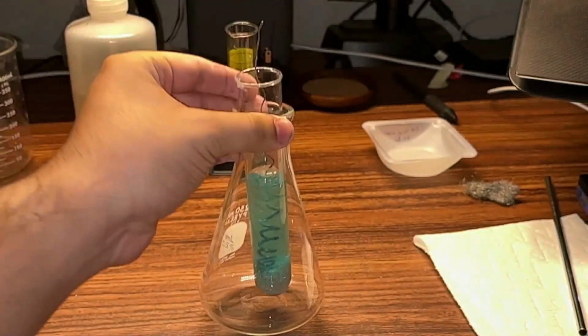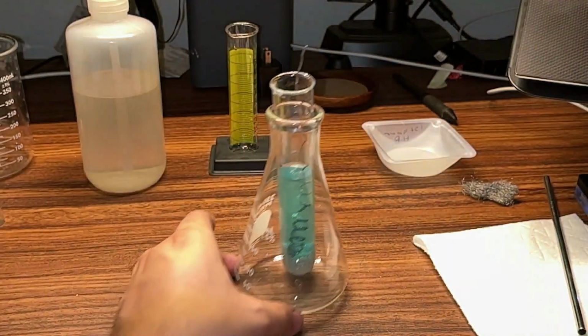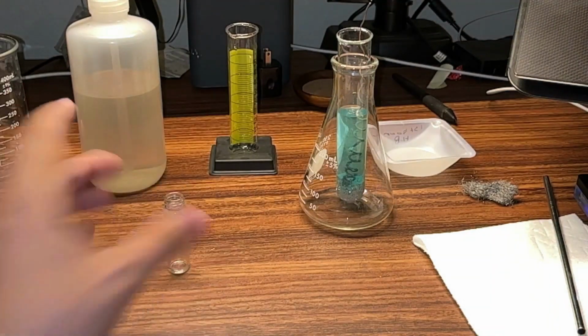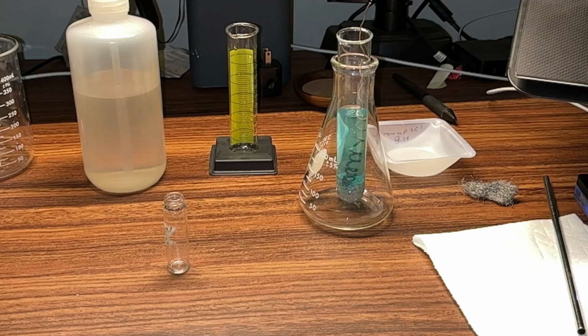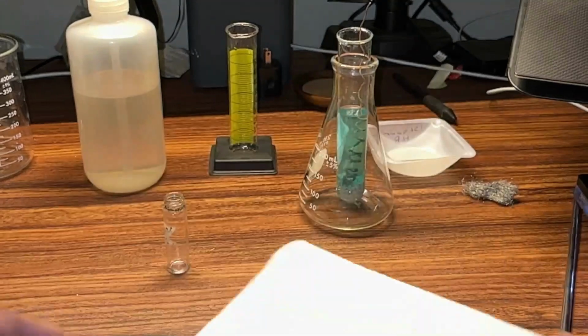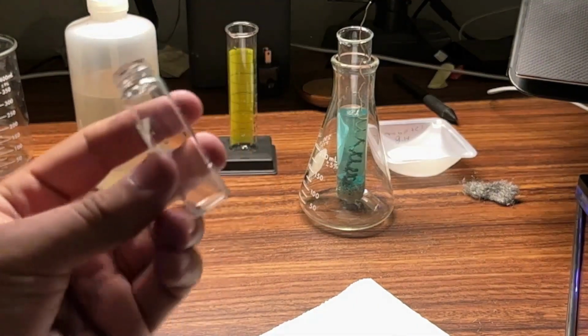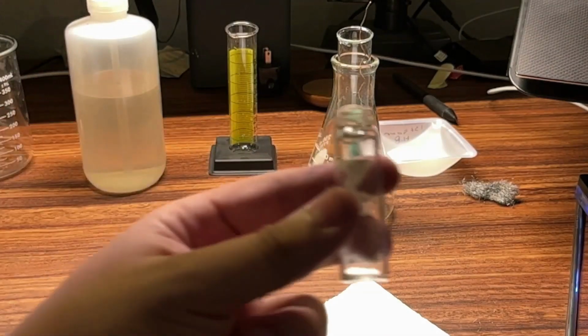Cool. I also realized that I didn't measure the vial, like it says, because that's an important step. That's step 9A, so I gotta do that. So, turn this light off. There we go.